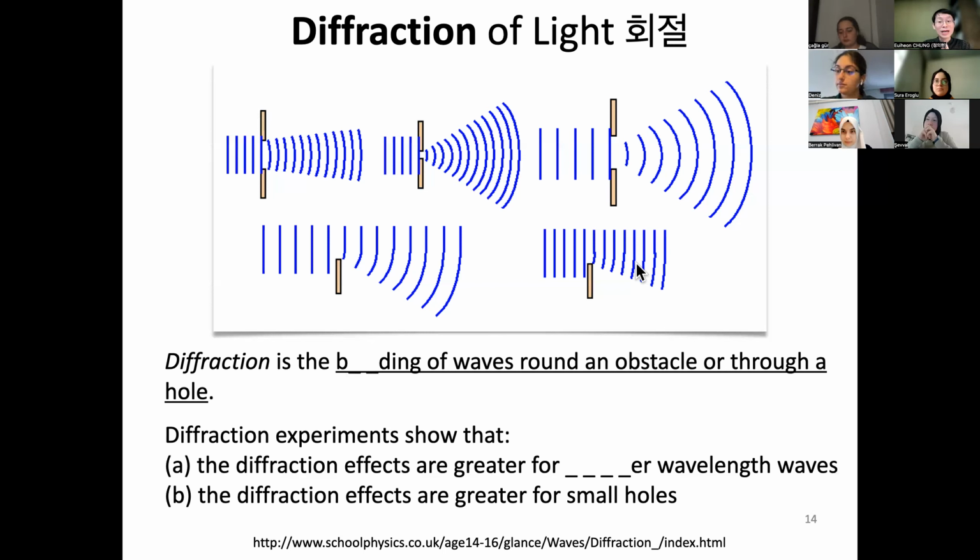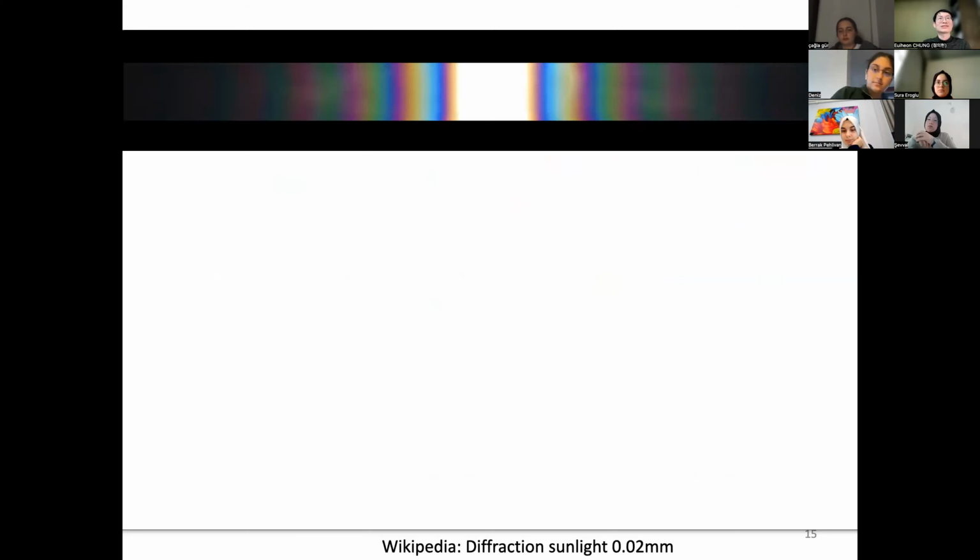Even electron microscopy, which you guys may encounter, electron is not a light, but it's a tiny particle. So, you know, in physics, even an electron has waves. It's called a matter wave. But an electron's wave is so tiny that we can achieve even higher, let's say nanometer or angstrom level resolution. That's why you guys will use electron microscope to see really small, tiny detail of subcellular organelles, or even like synapses and those.